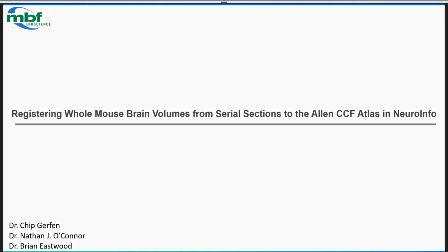I'm a product manager for NeuroInfo with MBF Bioscience, and we're going to be running through a webinar today on registering whole mouse brain volumes from serial sections to the Allen CCF in our NeuroInfo program. I'm thrilled to be joined today by renowned neuroanatomist Dr. Chip Gerfen, who's on the line with us, and our own MBF computational neuroscientist, Dr. Brian Eastwood. So we'll be discussing interactively as we go through.